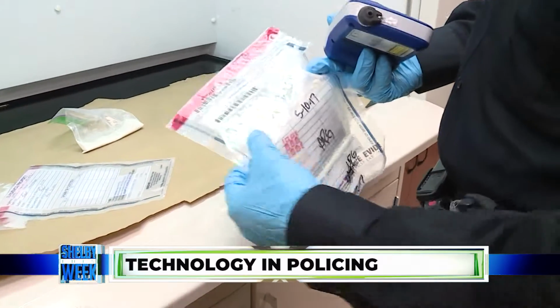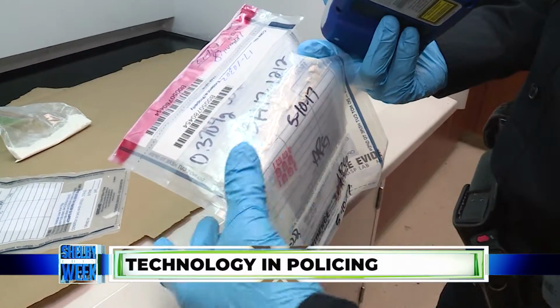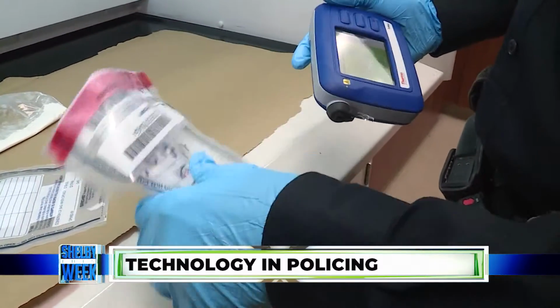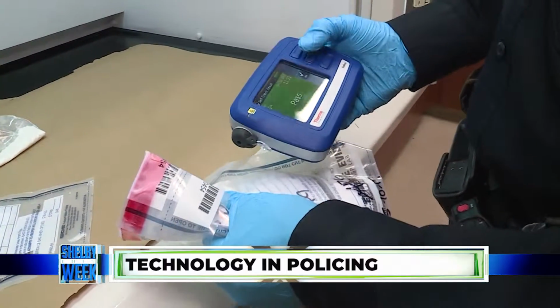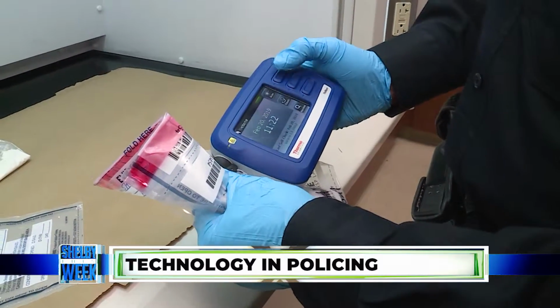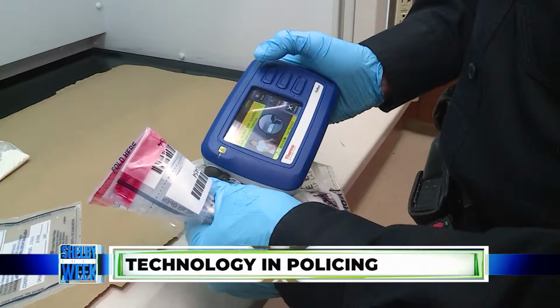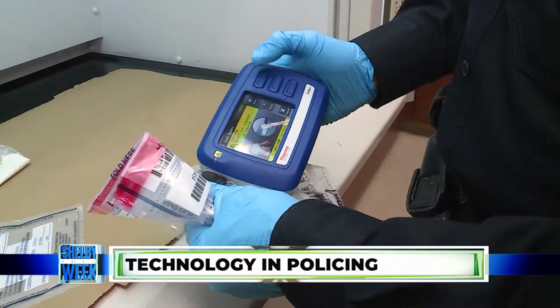See, it doesn't take much. As long as there's a clear background here, and as long as we can see some of the powder, it doesn't need a whole lot to scan, although the laser's coming out the end there. So all it's got to do is catch some of the substance you want to read. So I'll go through the pass, and then I'm going to go up to the scan button now that we did the self-check. Hold the laser on whatever substance you have and hit scan. Again, it's going to ask you, do not scan suspected energetic materials, because the laser's coming out the end.